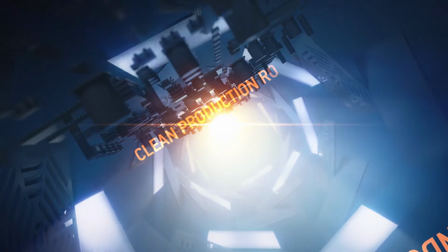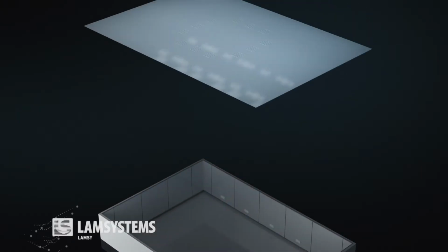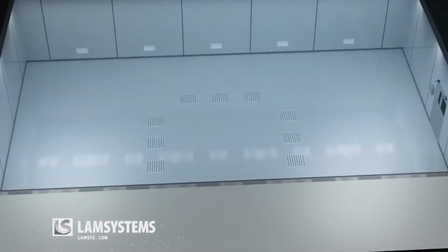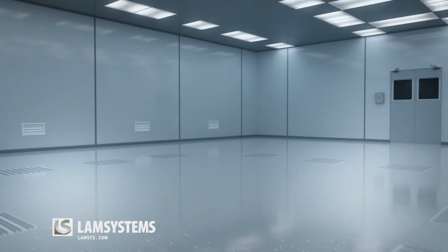Control and minimization of air contamination in such fields as medical, semiconductor, pharmaceutical, biotechnological, aerospace, food, cosmetics, and many other industries is carried out using clean production rooms. It is structurally complex and highly expensive equipment, ensuring required cleanliness class in accordance with ISO standard.